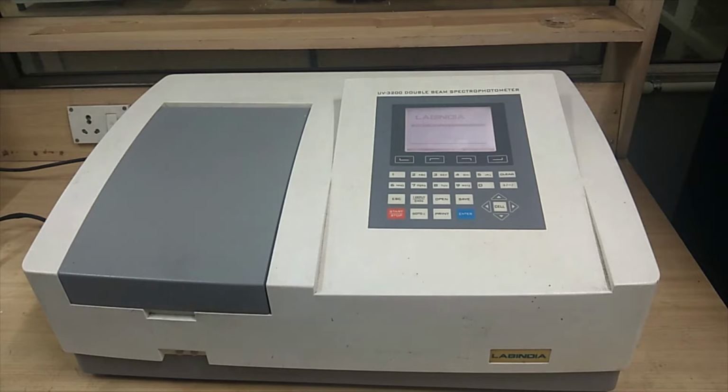We will now look at the demonstration part of UV visible spectrophotometer. In this video, we will do a protein analysis through the spectrophotometer, and this will help you for better understanding of the instrument as well as for the sample testing. So the instrument that is placed right in this video is a UV visible double beam spectrophotometer from Lab India.